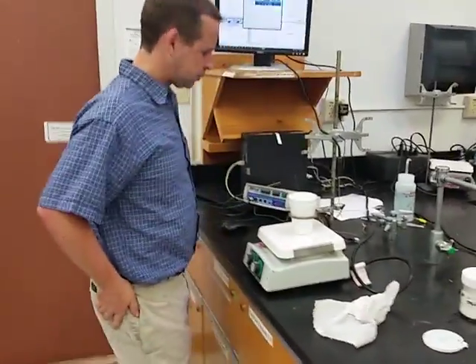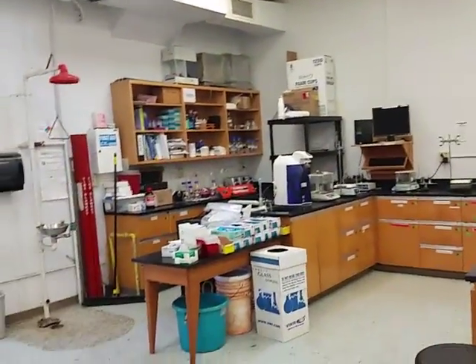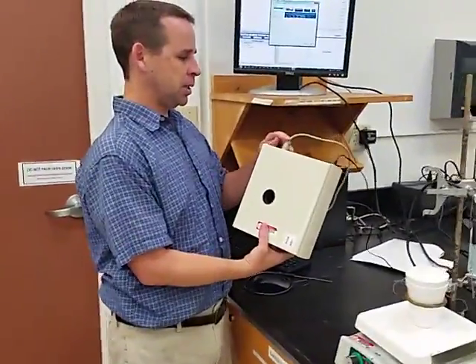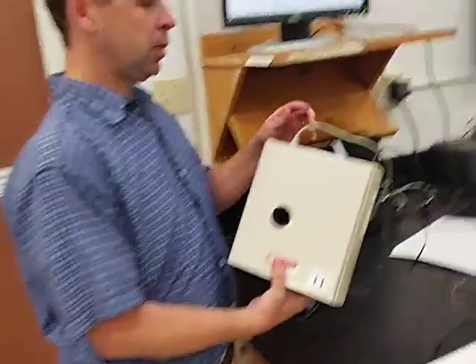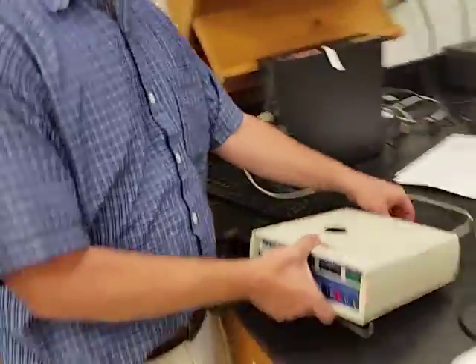There we go. I got this Microlab from the drawers over there by the backpacks. I have to make sure the Microlab is plugged into the computer through this USB cable and also plugged into the wall. Correct? All right.